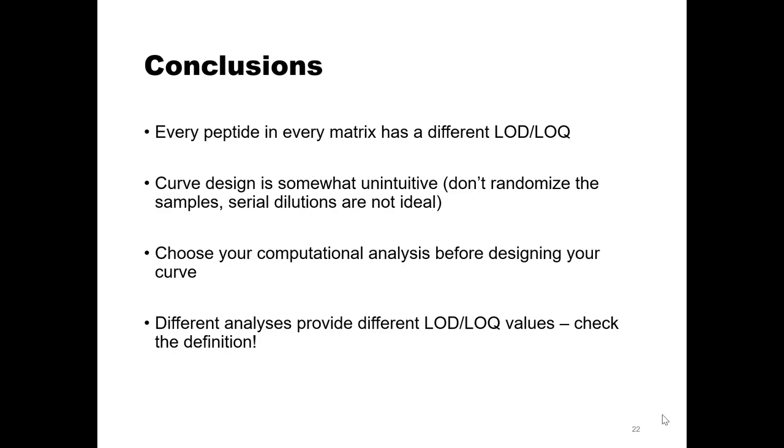Then you have to validate it by taking a sample that's about 20% higher than the lowest point of the curve that we have, precise ideally. So that's going to be the way it's done. That's not what all the researchers are going to do.